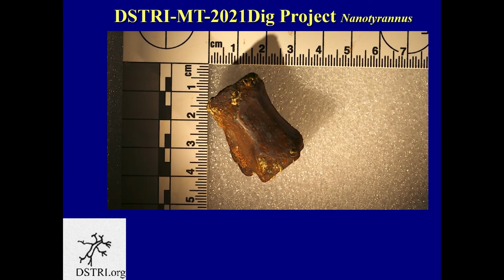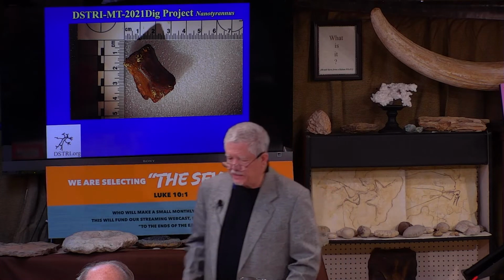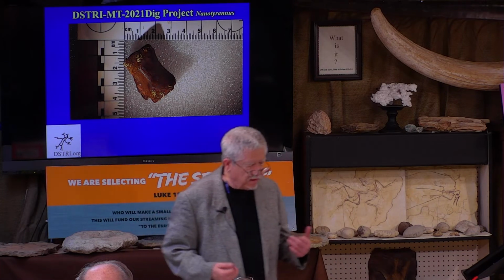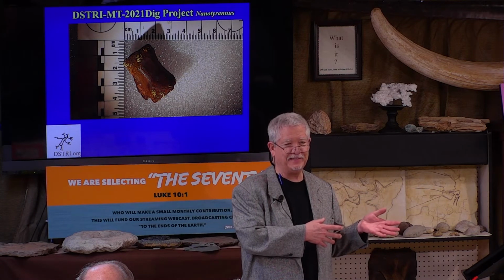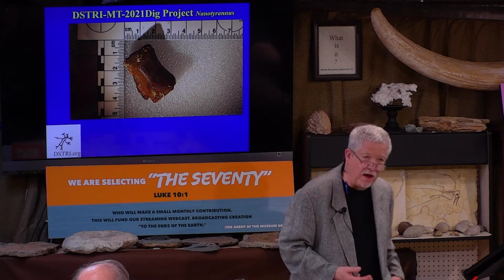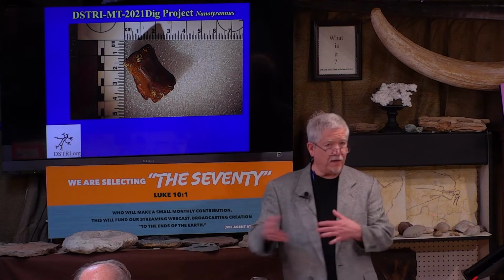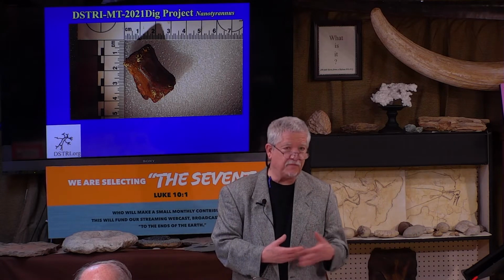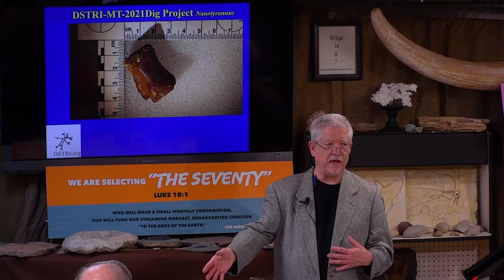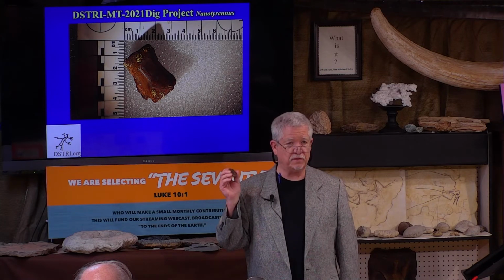So what I did is I lightly decalcified this. This is pre-decalcification. What is decalcification? EDTA is a weak acid that is used in hospitals every day of the week to dissolve human bones. So when you have a pathology in your bone and they take a biopsy of it, they process that. They put it through decal. They get rid of all the bone mineral and they look at the tissue to find the disease. We're doing the exact same thing on bones that are supposed to be so old that they've turned into rock. But folks, they're all bones.